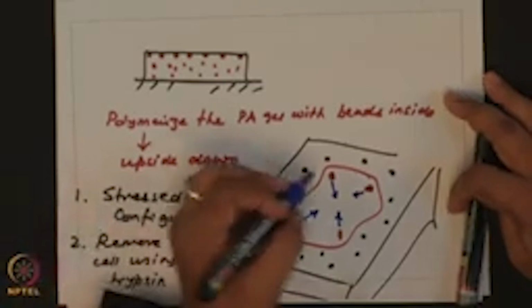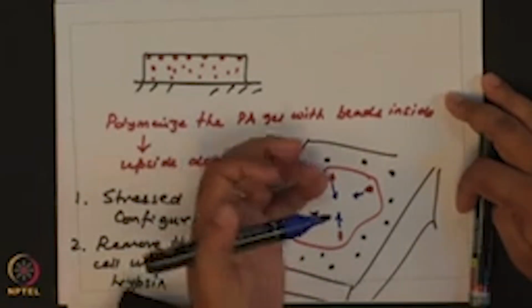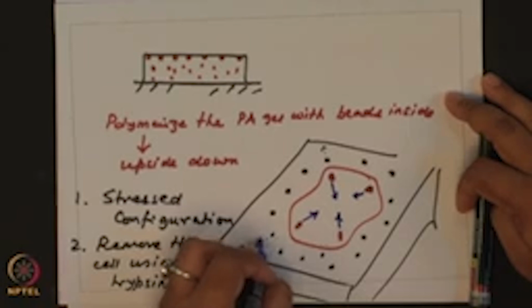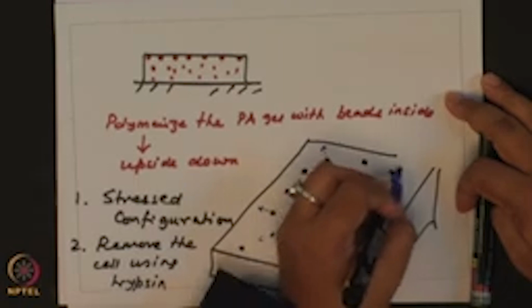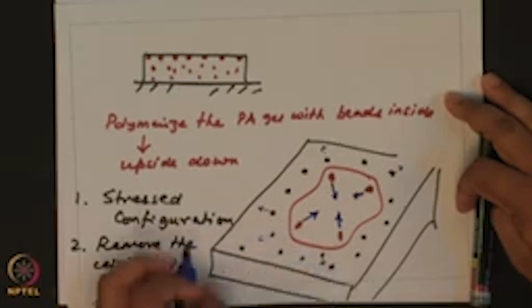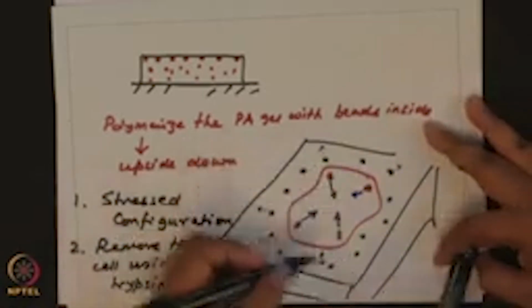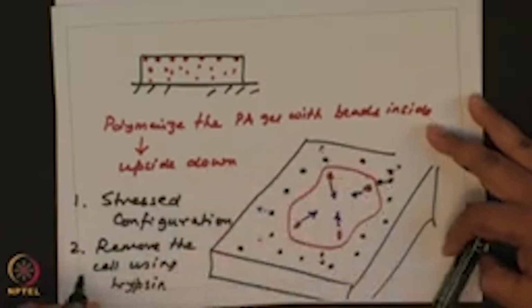Okay. So, if these were the original directions in which the cell was exerting forces, once I remove the cells, these beads would move in the outward directions. But the beads which are far from the cell may not have any effective displacement, while the beads positioned close to the cell will move in outward directions. Okay.